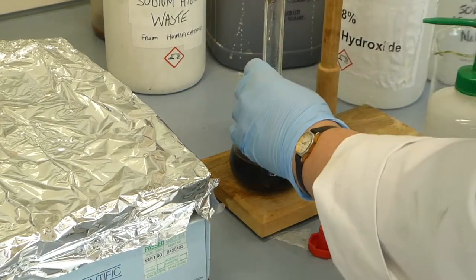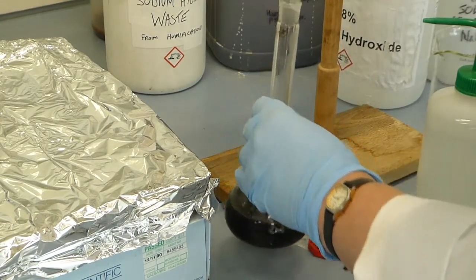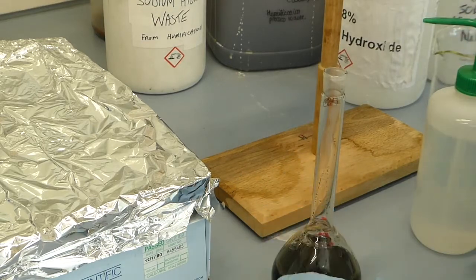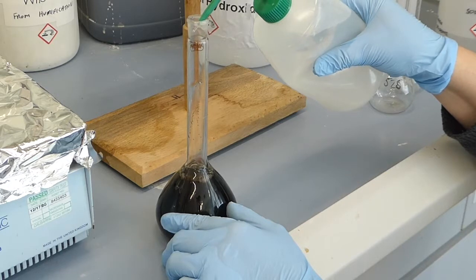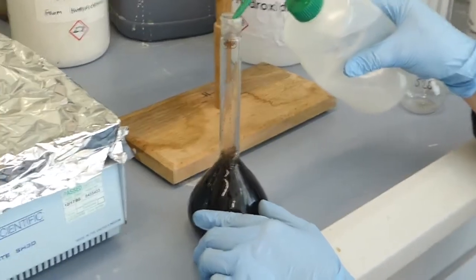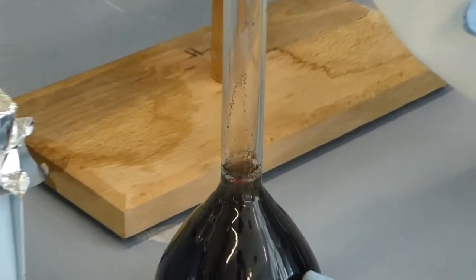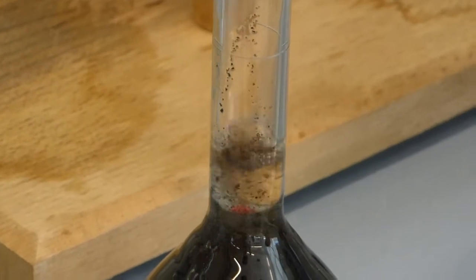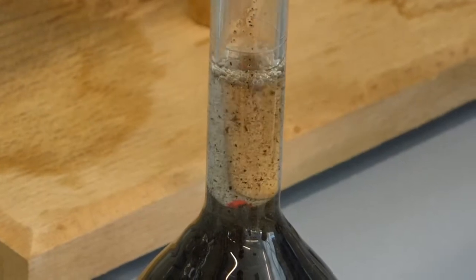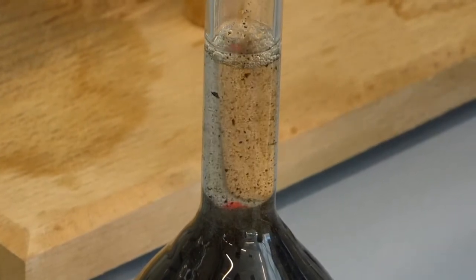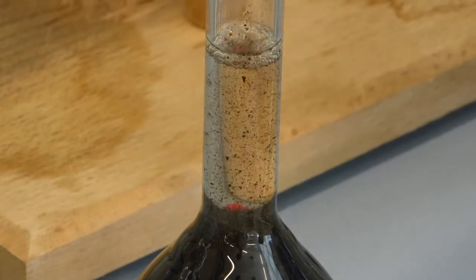Once you've poured through all your sample, you then want to fill the flask up to the 200 ml line with distilled water. You want the base of the meniscus to be on top of the line.